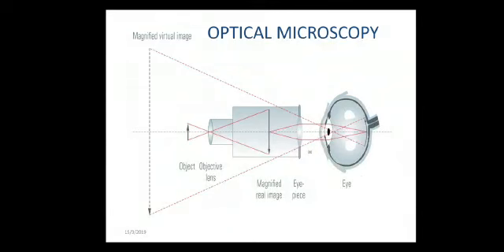We use optical microscopy in the study of microelectronics, nanophysics, biotechnological applications, and medical diagnosis applications. The advantages of optical microscopy are that the cost is minimal, it is a simple device, it is a faster process, and it can be operated by a semi-skilled operator.